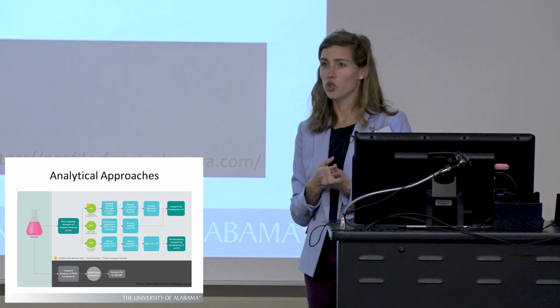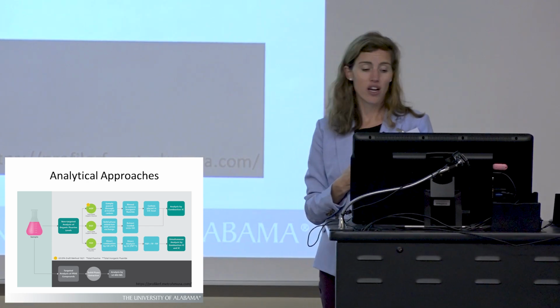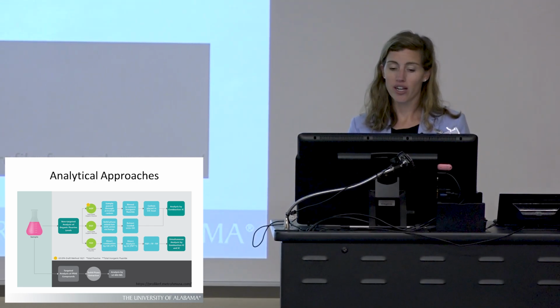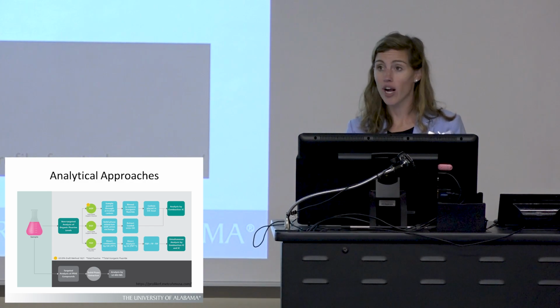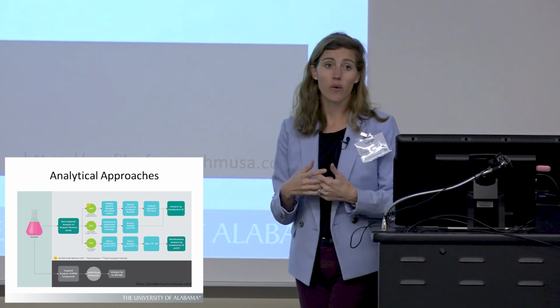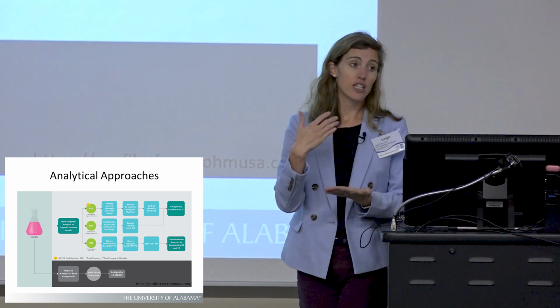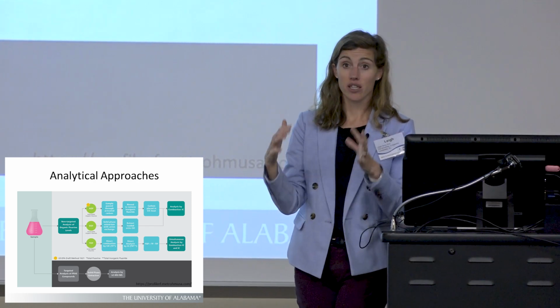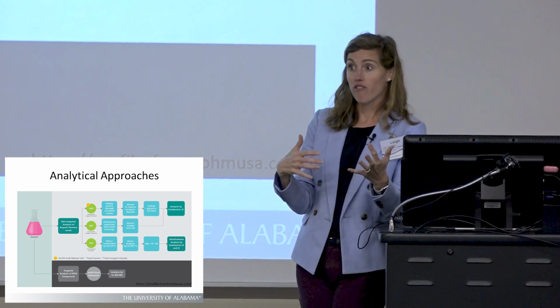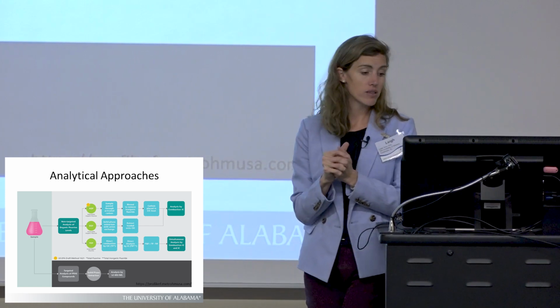There is currently a draft method in the EPA for this. It's method 1621 for total fluorine and then total inorganic fluoride. This is a draft method, so it's not been published. So we're going to work hopefully to get this method to have more than one lab that can reliably do this method, to get it not just in draft form, but an actual EPA method.